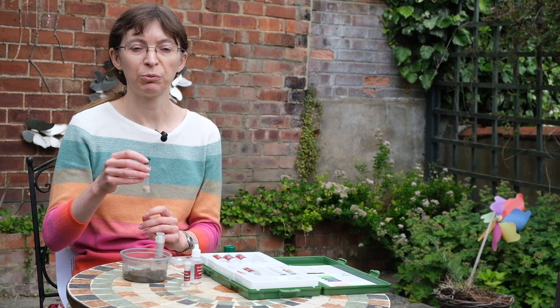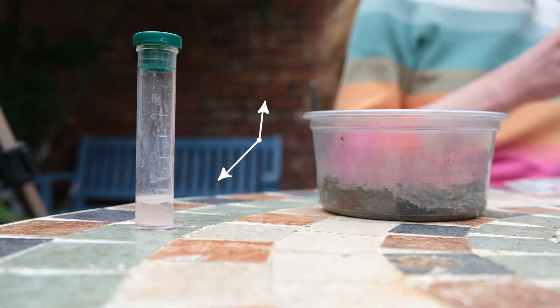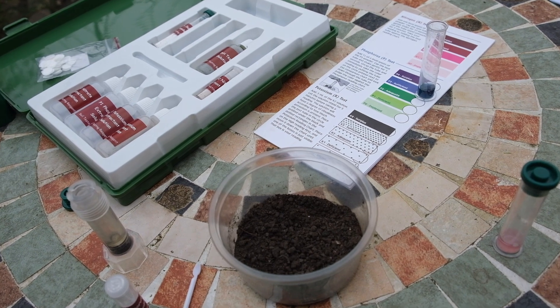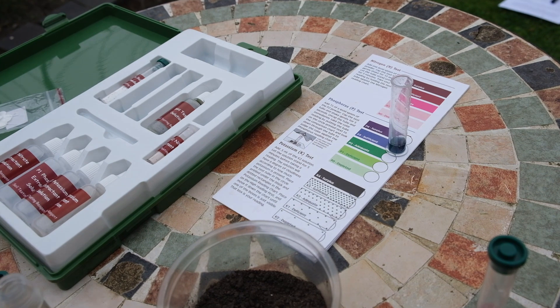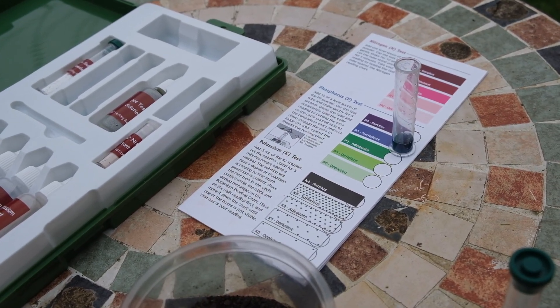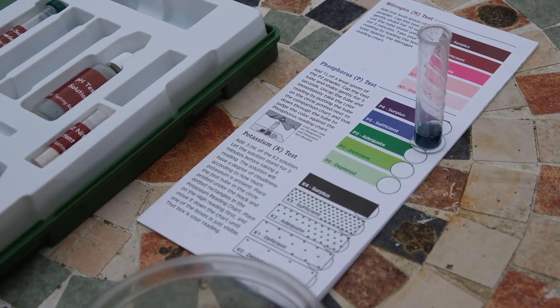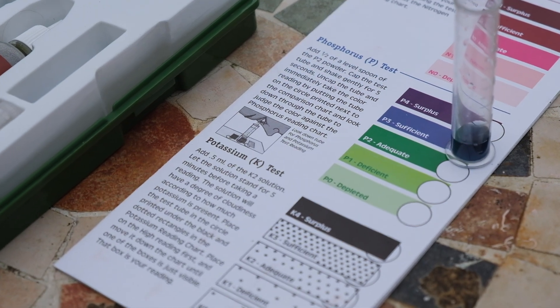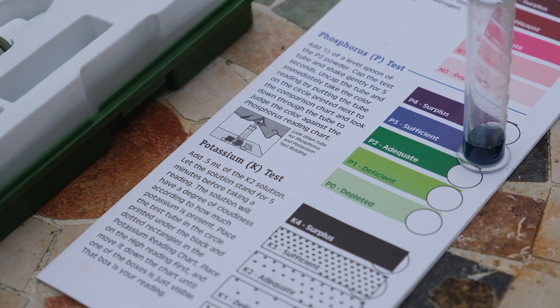And now this solution needs to be put aside for five minutes to react. Let's now look at the phosphorus test of the soil in my garden. This test is very quick and the result is available immediately. We can review the results by comparing the color of the solution against the color test chart. The solution is blue-green, which means that there is sufficient phosphorus in the soil in my garden.